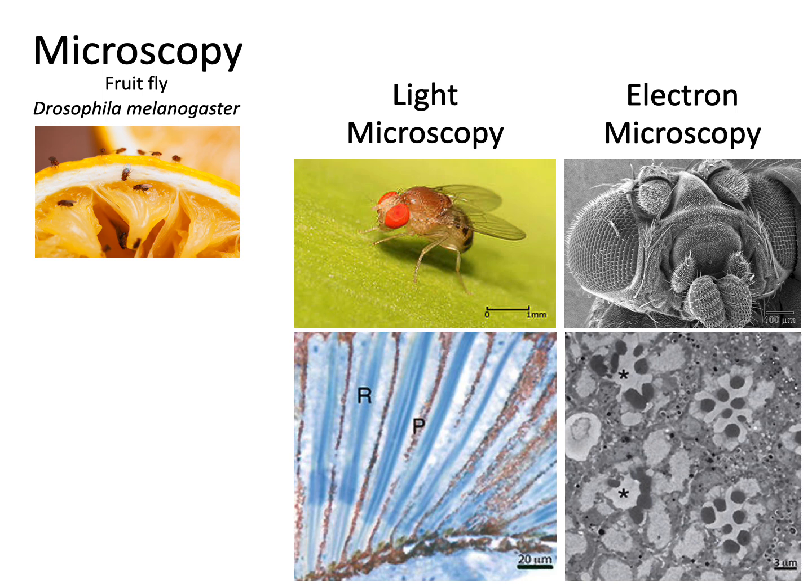So I've carefully kept some consistency in the way the panels are arranged because there's similarities in the technical strategies. Because on the upper right, this is electron microscopy, specifically called scanning electron microscopy.